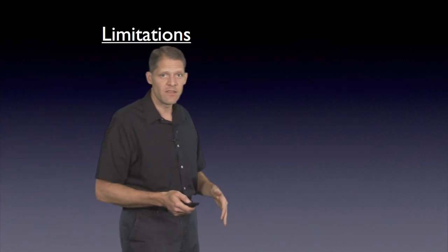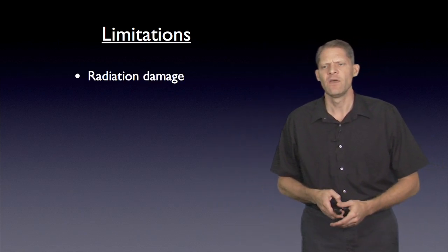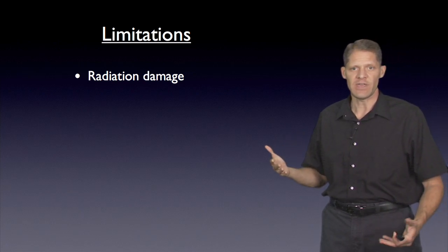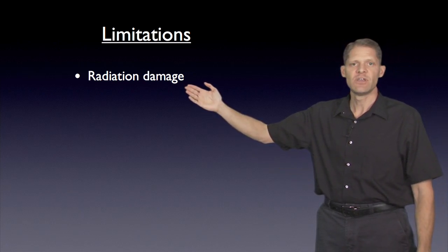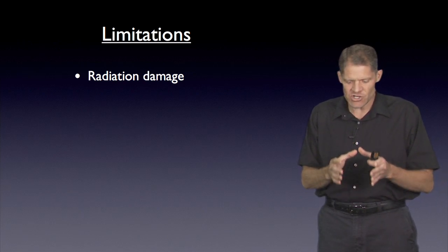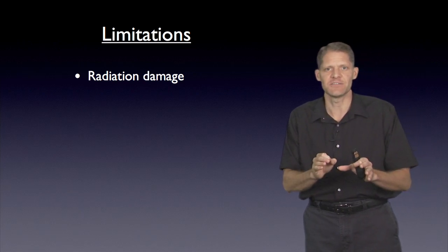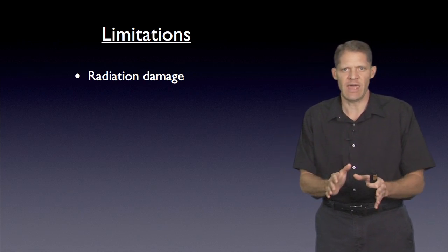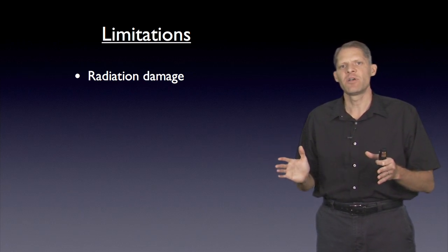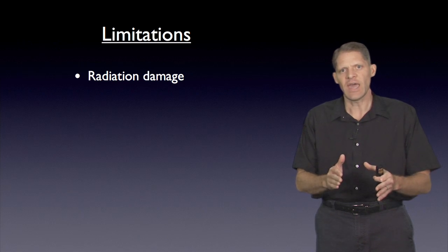That all being said, there are important limitations in single particle analysis as well. The fundamental resolution limitation, as it is in all of cryo-EM, is radiation damage, meaning that we simply can't fire enough electrons at each object of interest to get a crisp picture of its details before we've destroyed that particle through radiation damage. So we have to take a large number of low-dose, low signal-to-noise ratio images and then average them.